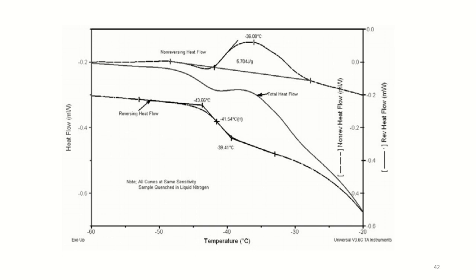using conventional DSC. The second transition is an exotherm in the non-reversing signal caused by crystallization of free water that could not crystallize during the quench cooling of the sample.